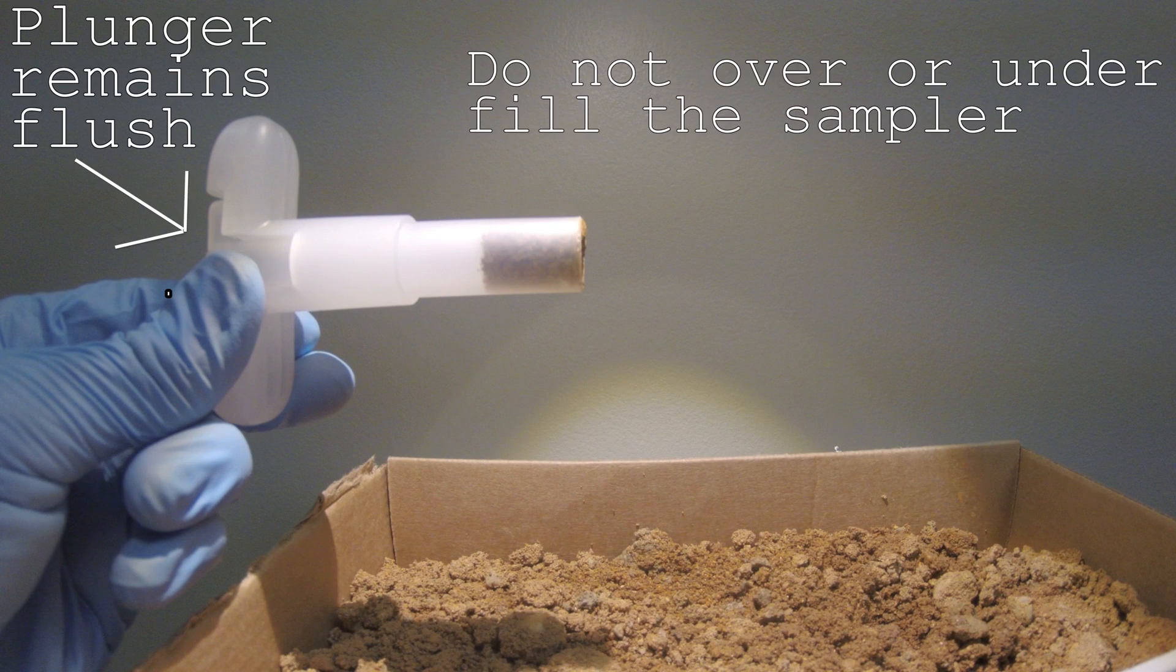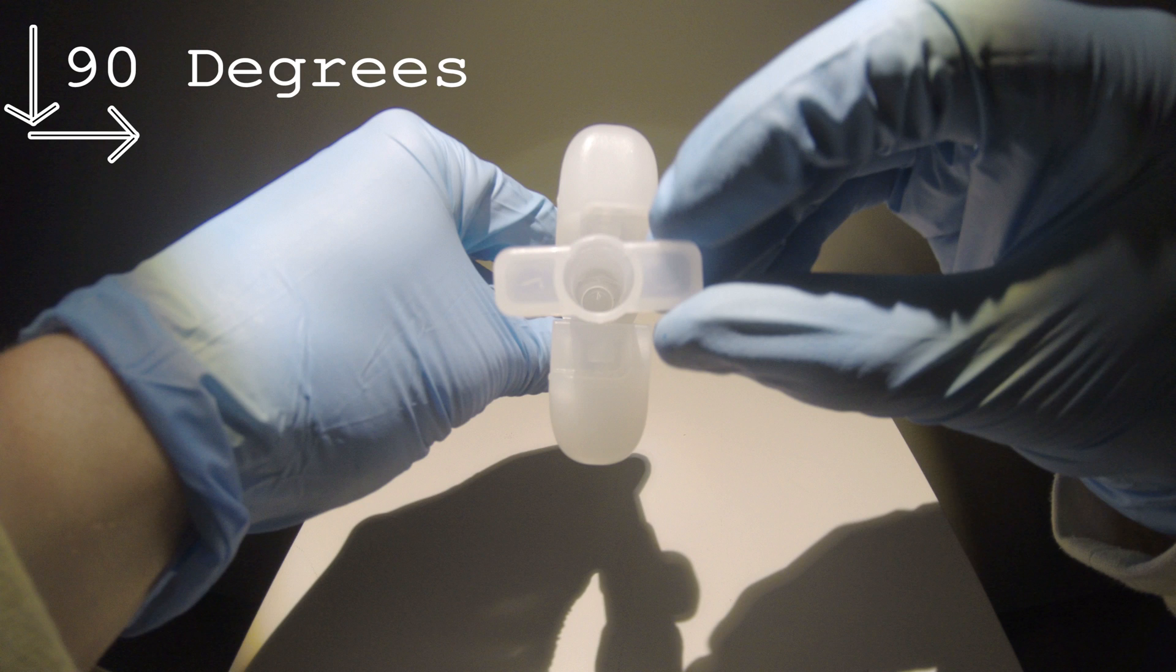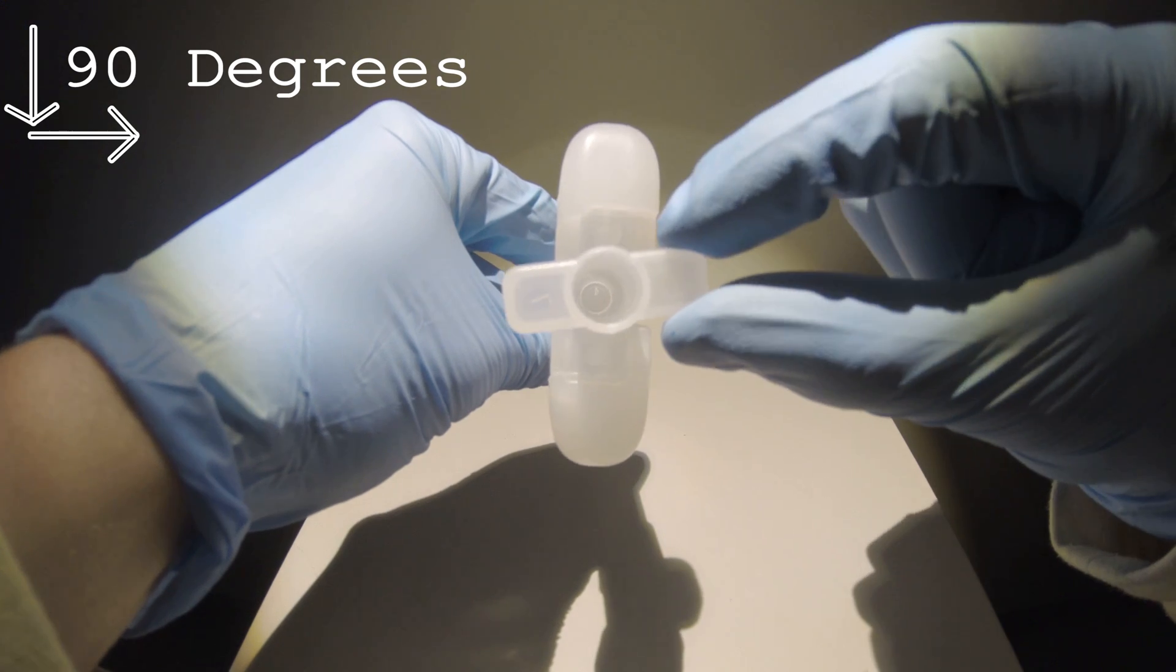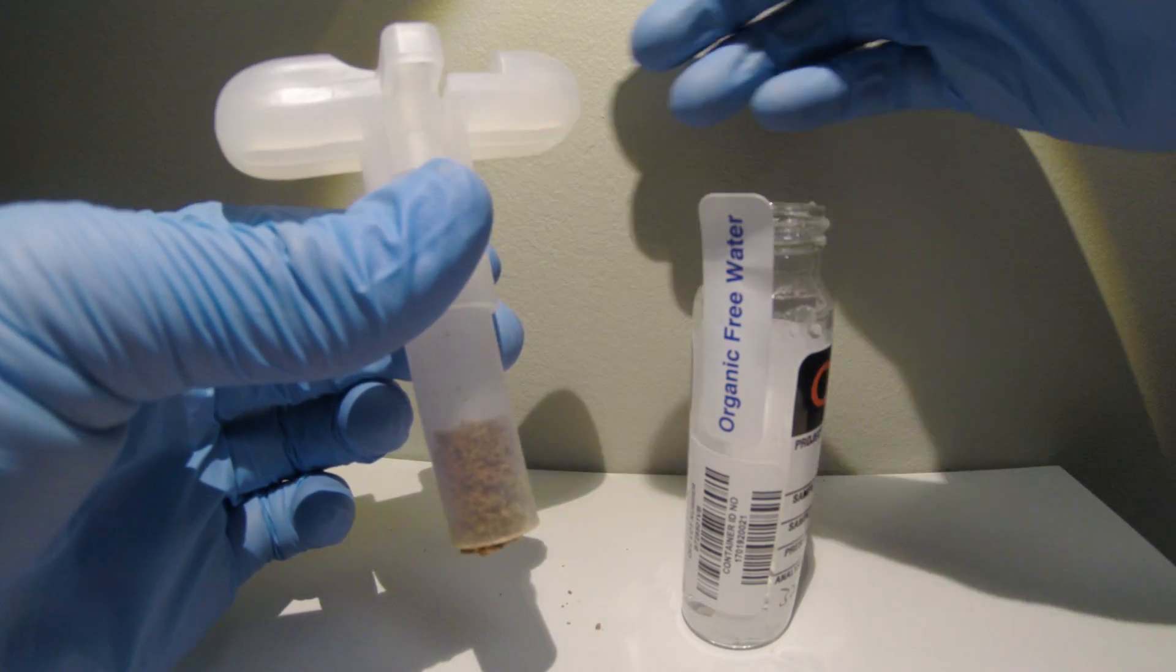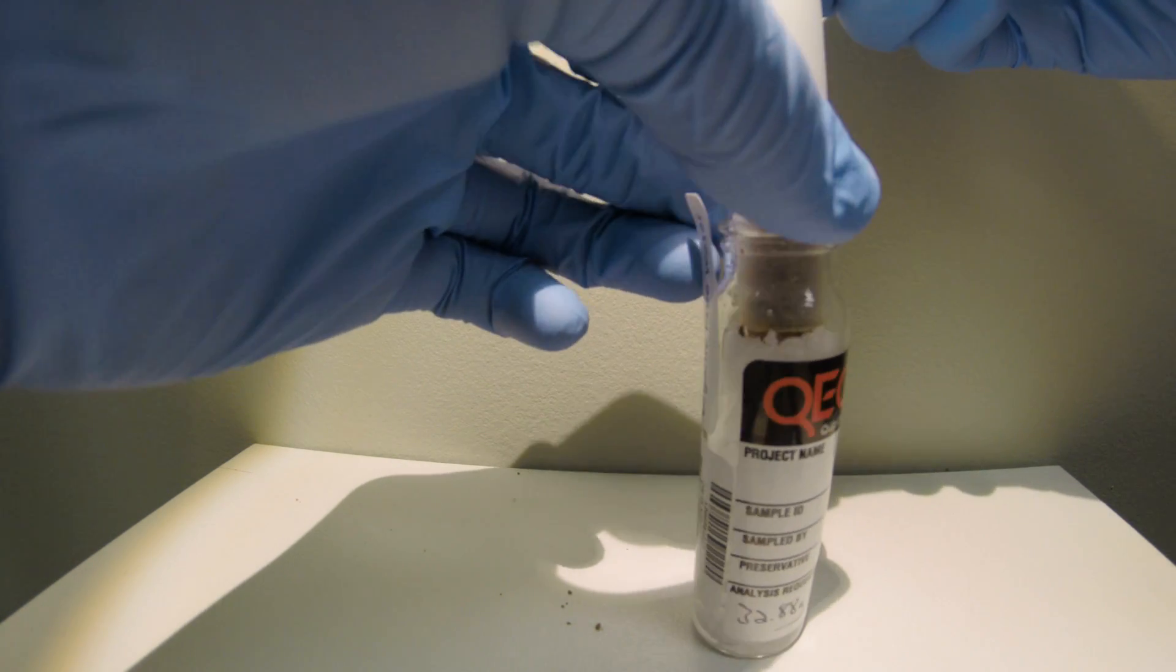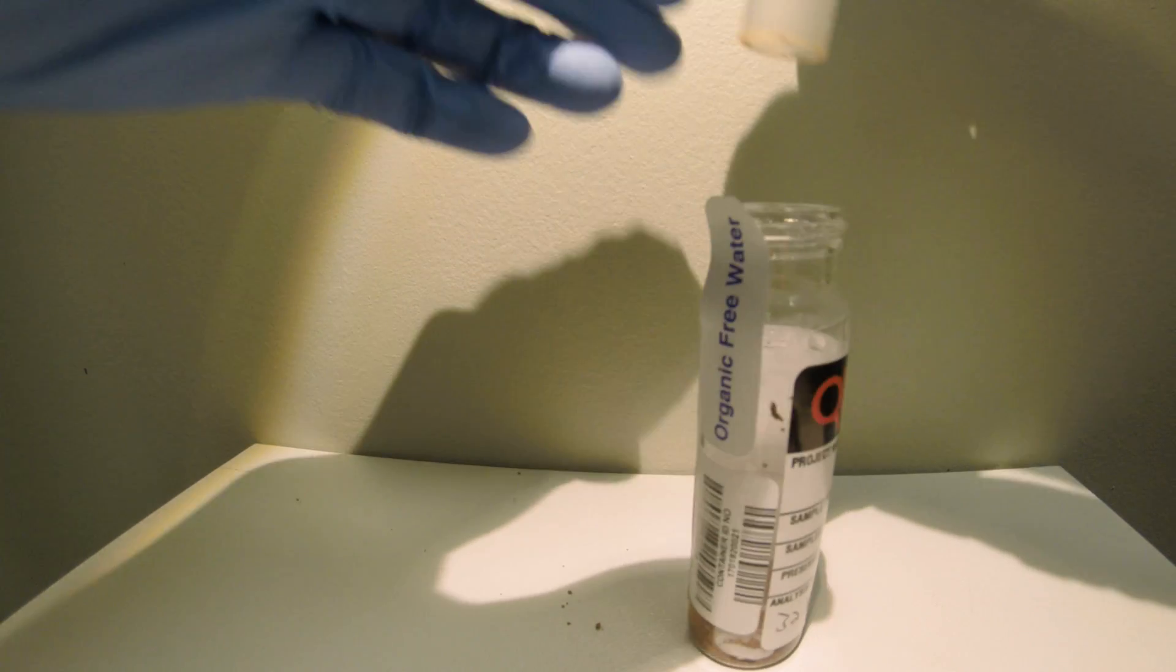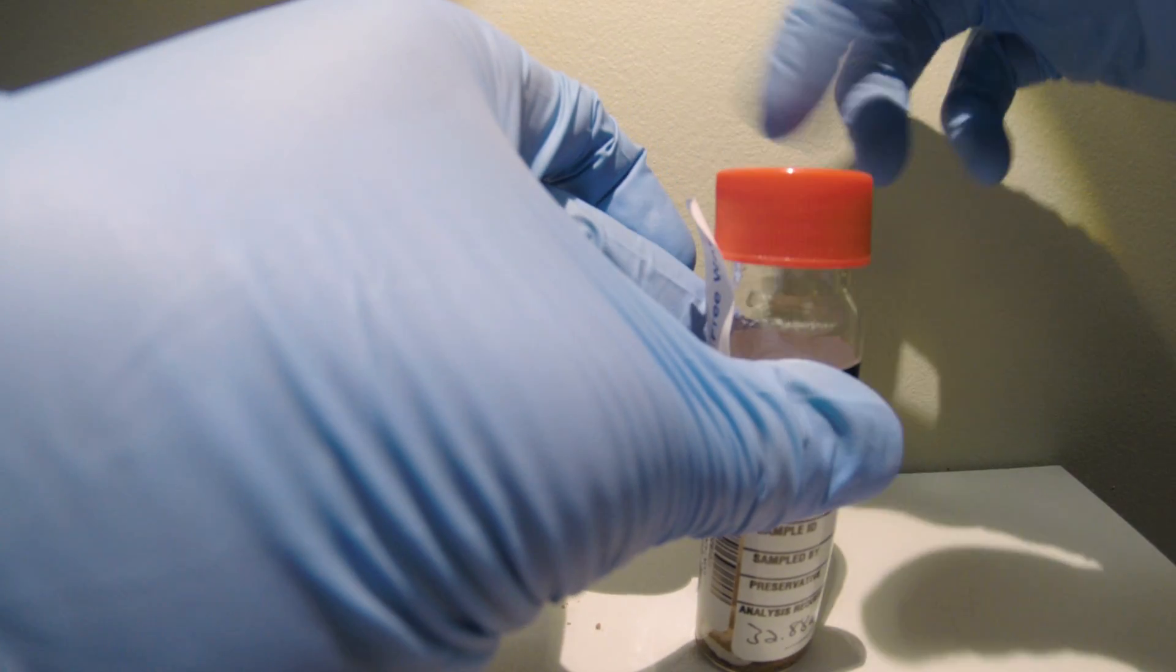The sample can now be pushed into the vial from the sampler using the plunger. As shown, lift the plunger out of the sampler and turn it 90 degrees. Once the plunger is oriented properly, place the sampler into the vial and push all of the sample through. Afterwards, quickly cap the vial.